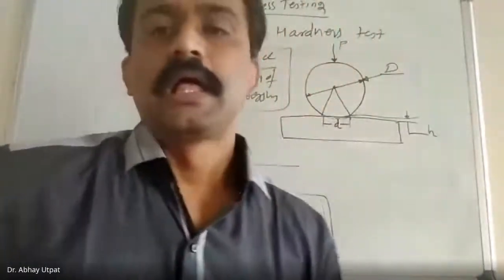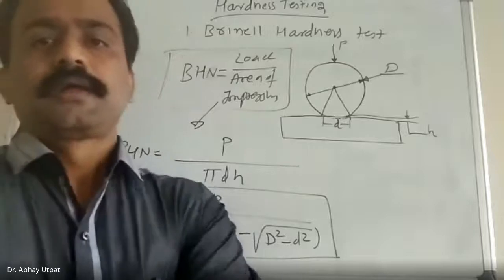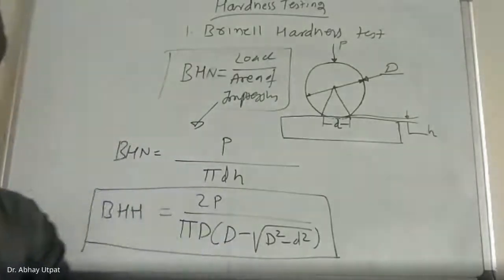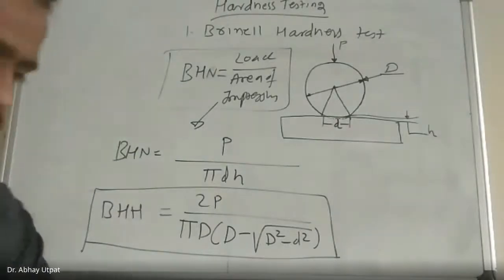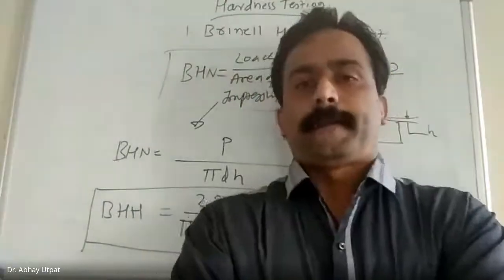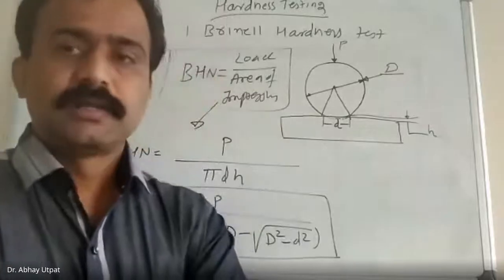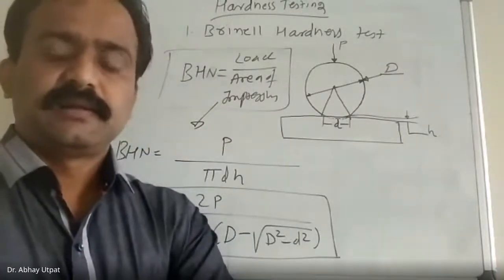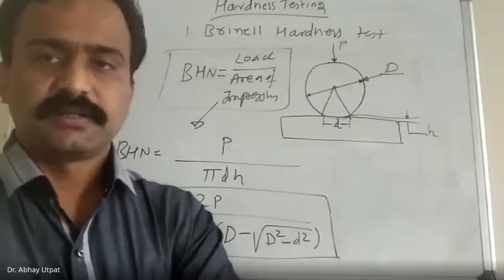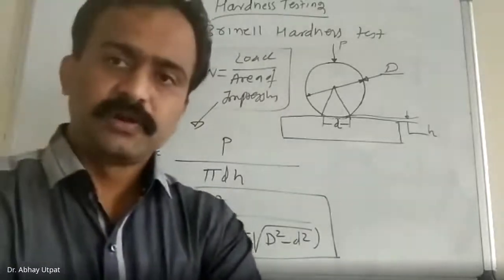Second, heavy load decreases the life of the component. Third, thin plates are difficult to test.